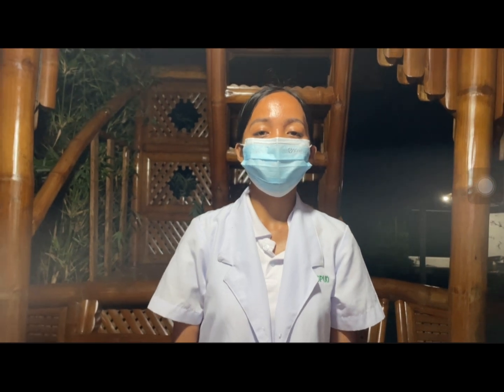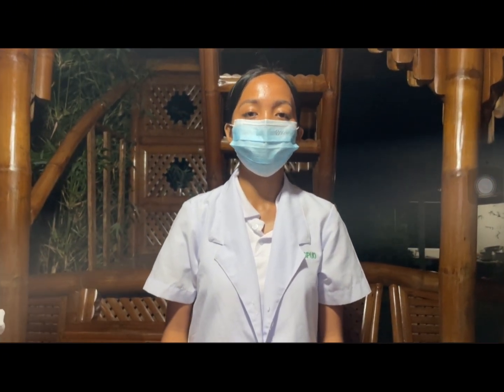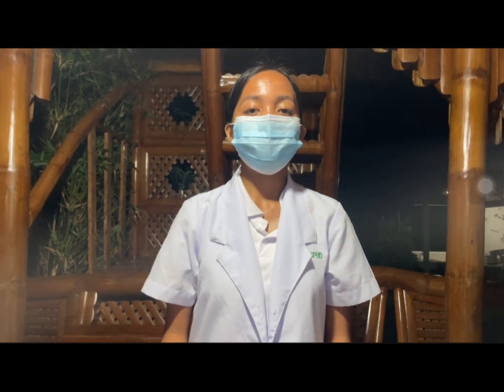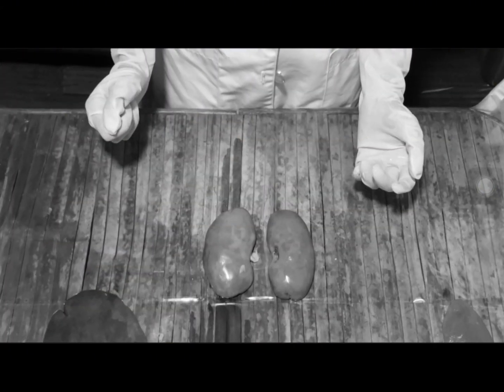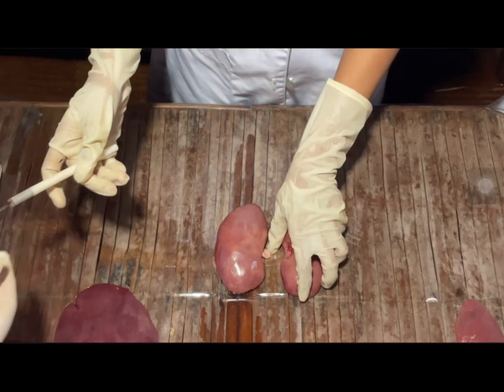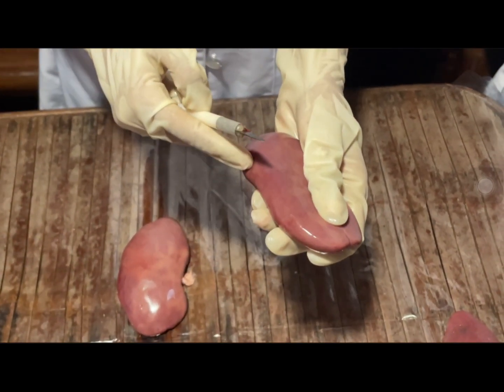Now that we are done identifying the external parts of the kidney, let us proceed to its internal part. But before that, let us first cut the kidney in half lengthwise. Let us cut here along the lateral margin.